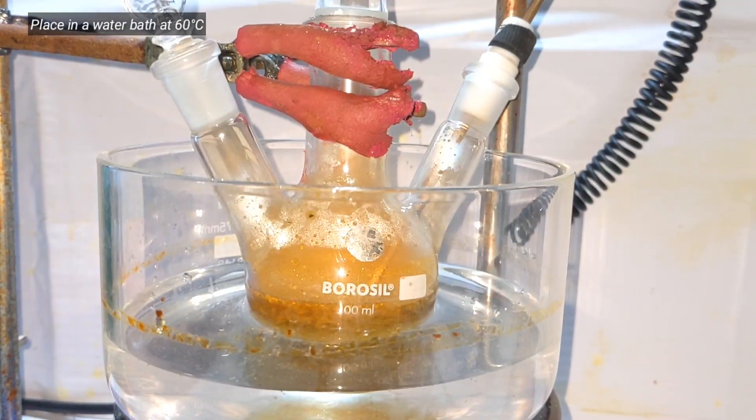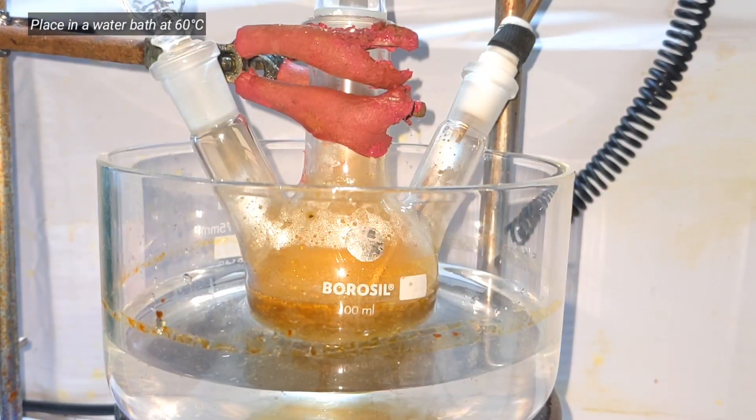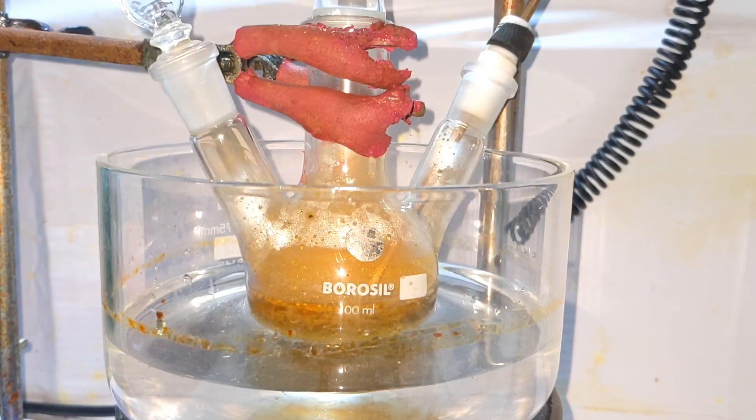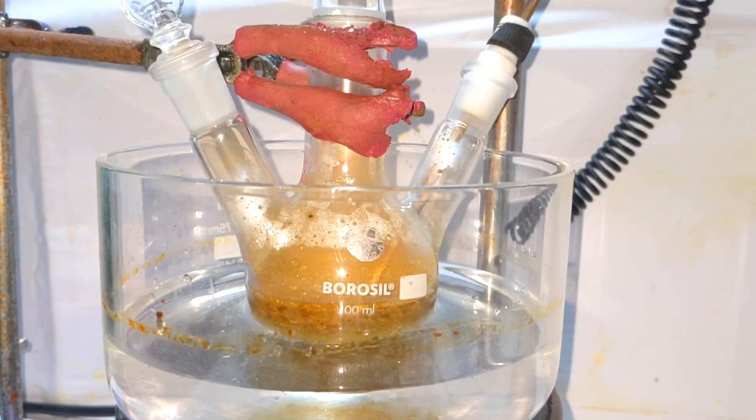The reaction mixture was then placed in a water bath and heated to 60 degrees Celsius. A beautiful color change from dark red to a yellow golden color is obtained. I couldn't capture the video because I was busy trying to arrange the water baths during that time.